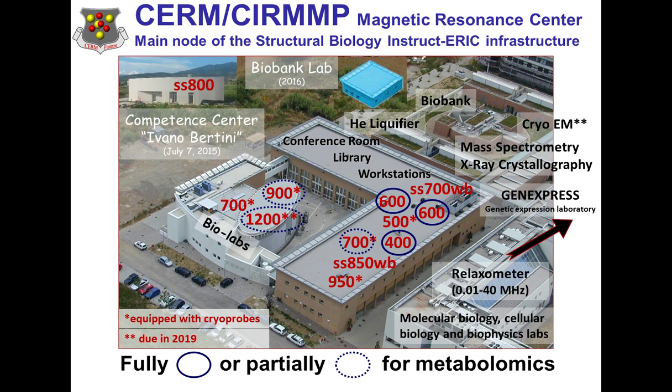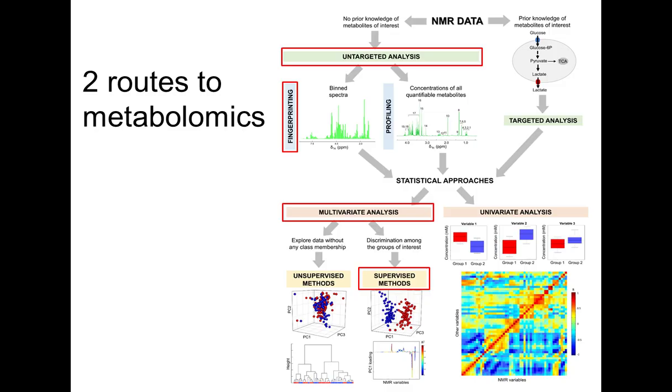My idea was to give you a very quick overview of the approach that we had to metabolomics, speaking about health metabolomics, although we also look at food. And this is, let's say, one of the 2 or 3 concept slides that I have. Basically, this is the whole flow of information and strategy to obtain metabolomic data.